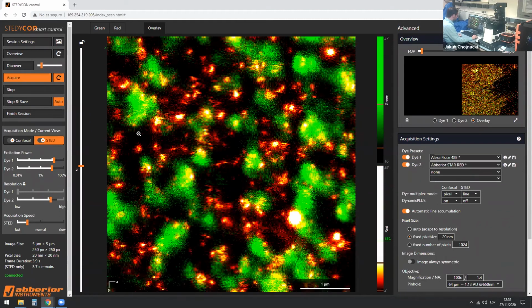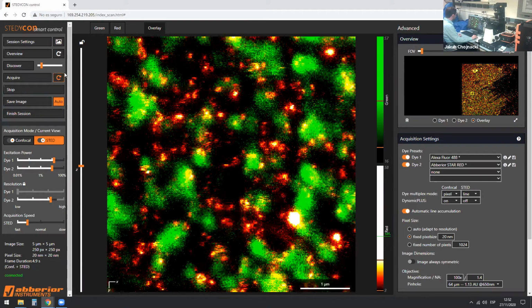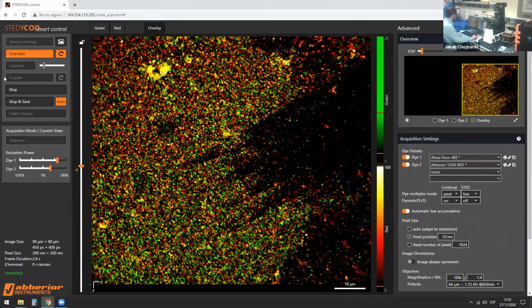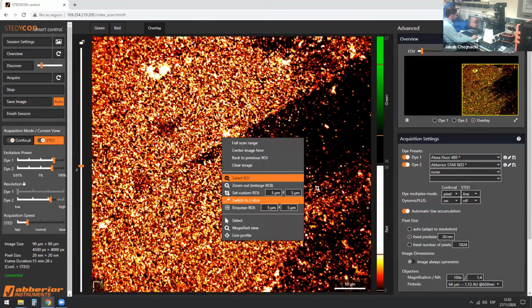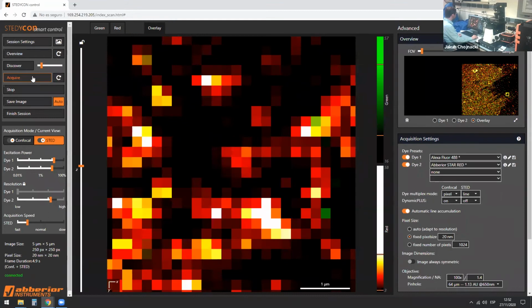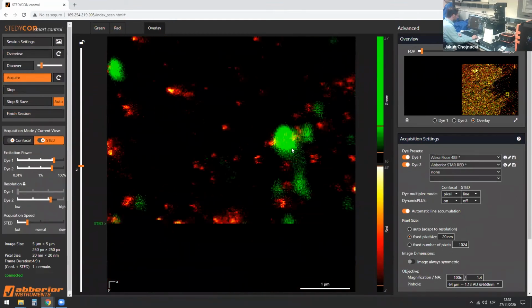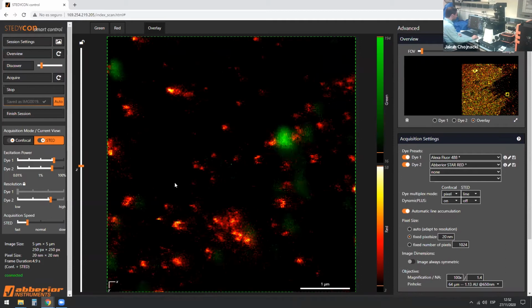Quite a lot of virus particles. No, not so good. Let me try one final time to find somewhere where there are not so many. Maybe here, let's try here. A little bit messy as well, not so great.